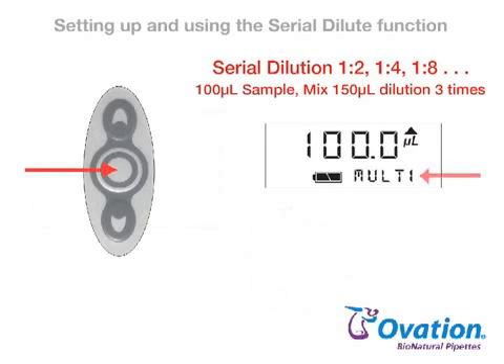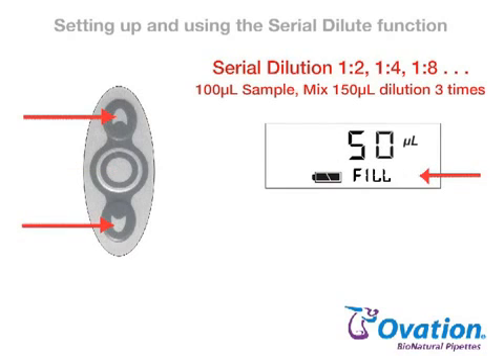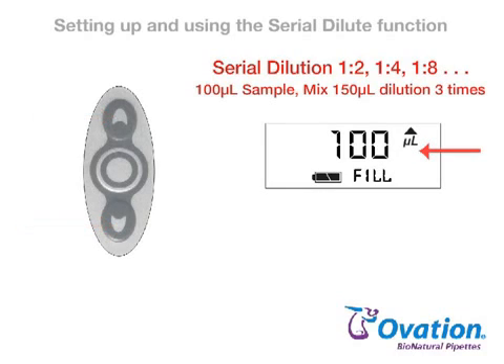Press and release the center button until S-DIL appears on the display. Press the up or down arrow and FILL appears on the display with the current volume setting for aspiration. Press the up or down arrow again until the desired setting is displayed. Press and release the center button to lock in this new volume setting and advance to the current speed setting.